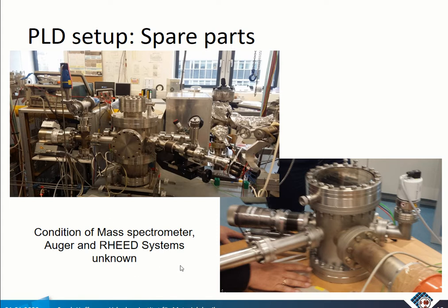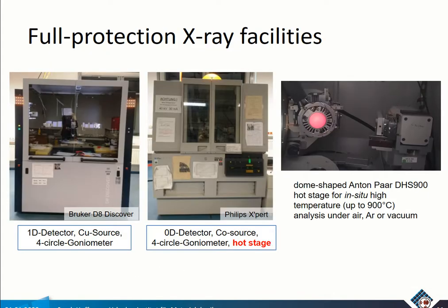Yeah, this was the part for the deposition. Now I'm showing you our X-ray facilities.